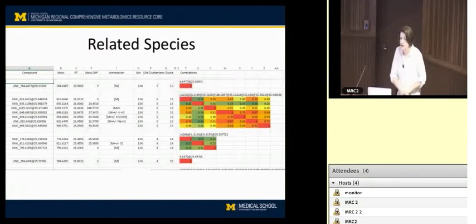Well, the data report you'll get will have ANOVA or t-test or whatever is the appropriate statistical tests that have been run on it, and you will get some p-values and fold change analysis. And I think others are going to talk about the statistics more, so I didn't really cover that. But so you'll already have some sense of what the differences are between your groups.